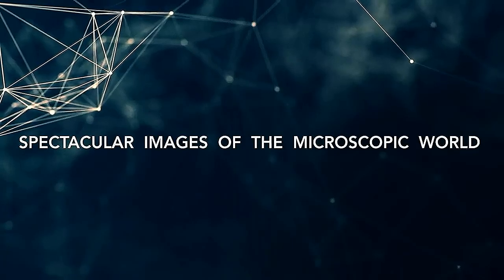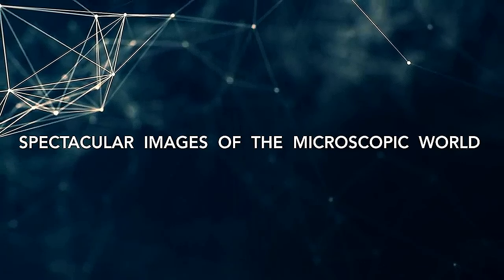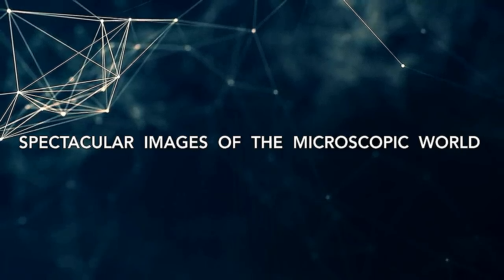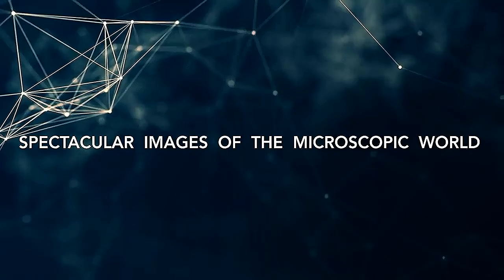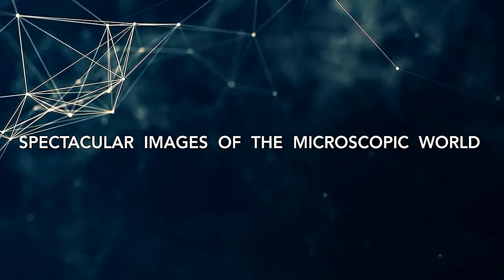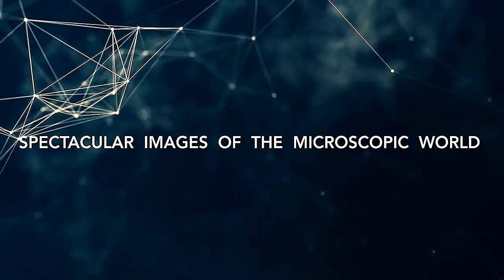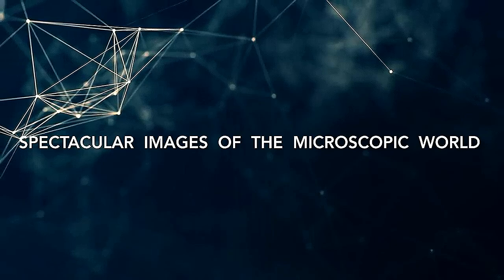Scanning electron microscopes produce images of any samples with stunning clarity and depth of field by scanning it with a focused beam of electrons. Even everyday things look completely different when they are magnified and viewed under one. Here are some incredible images of different things under an electron microscope.